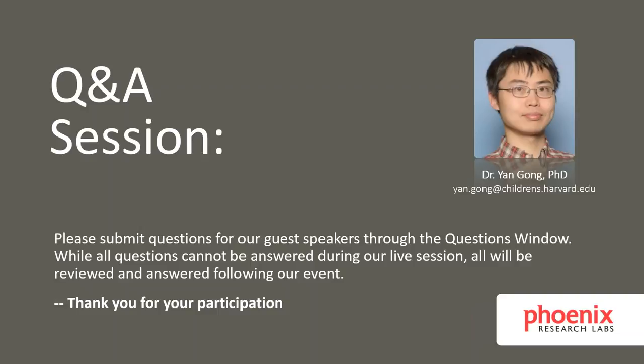Okay, great, thank you. And Dr. Gong, have you tried to do ERG analysis of the laser lesions? No, because we're using the laser-induced CNV model for AMD as an animal model over a short time range. If we want to check some effects of laser induced in the eye for a longer time, maybe the ERG is useful. But for our case, we didn't use the ERG for our laser lesions.